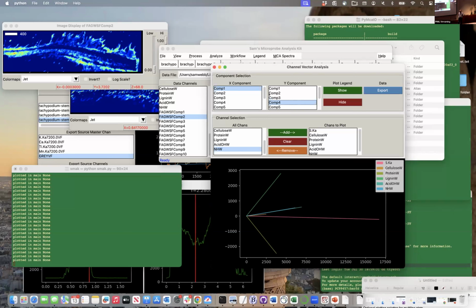We may have had a little bit better, I would say, in the core maybe, where we see things. Also, mind you, I'm doing this with the 5 channels that we annotated really easily, not with the full spectrum data. So that's another aspect maybe why we don't see a clear correlation in there.